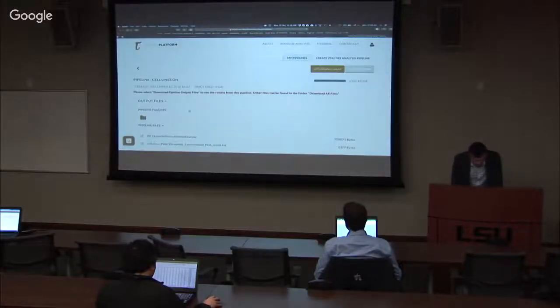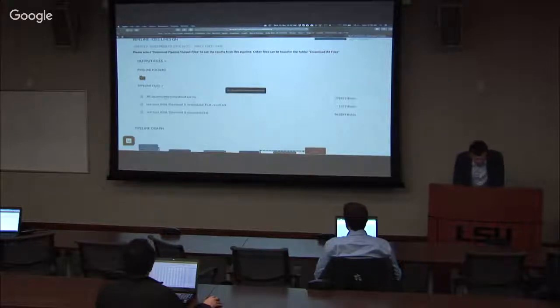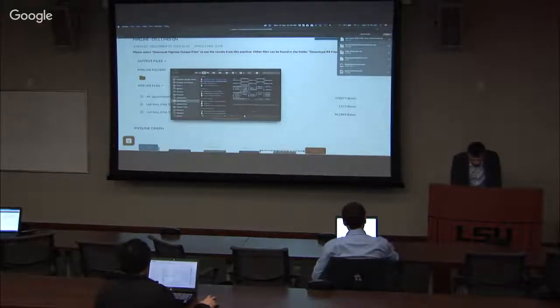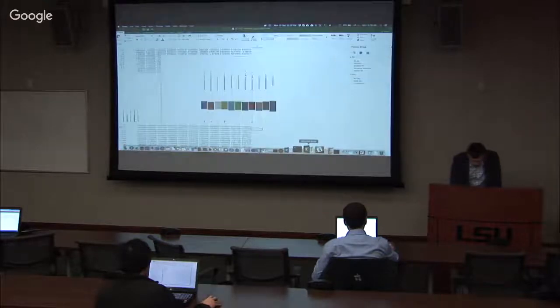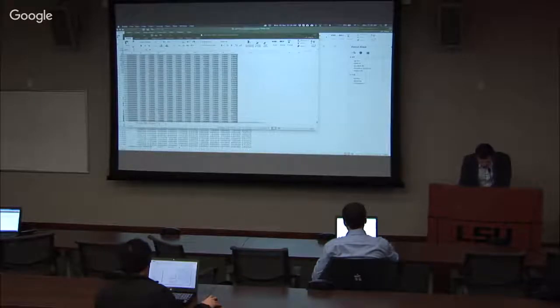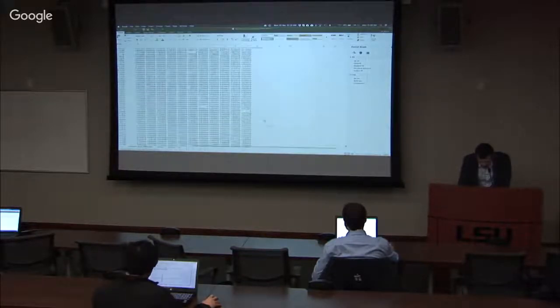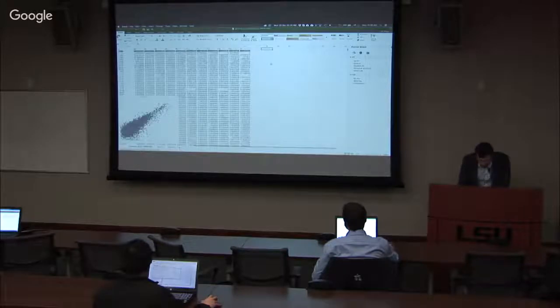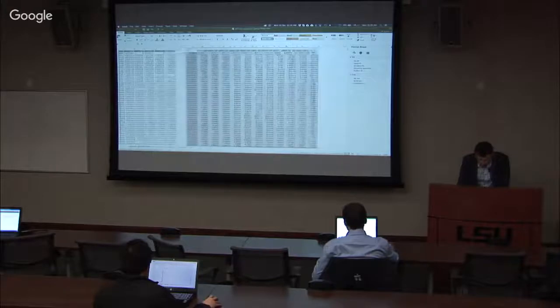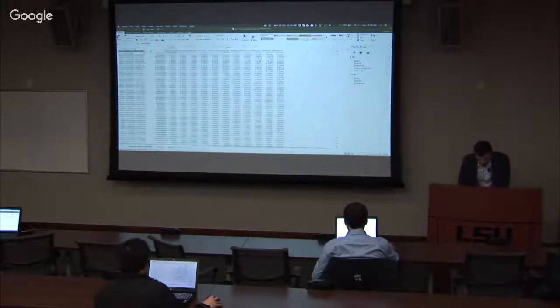So my pipeline finished here, and then you have this all quantile normalization and download. Actually, it's also here. Take that. And let's open that in Excel. And we can just copy it over to this spreadsheet right here. So what will happen to these?